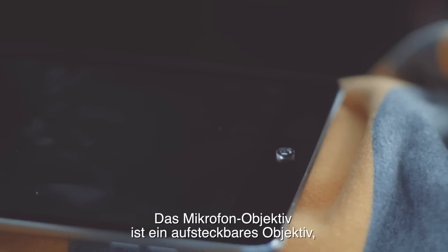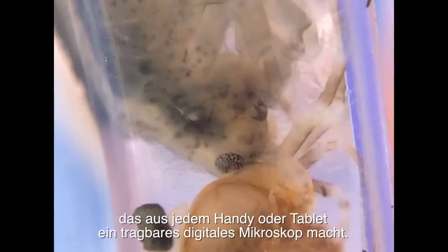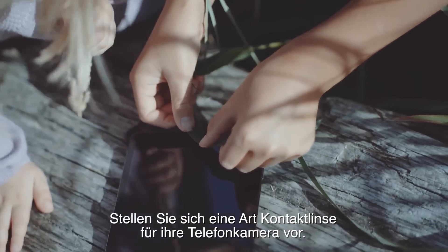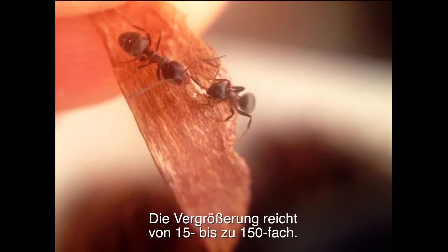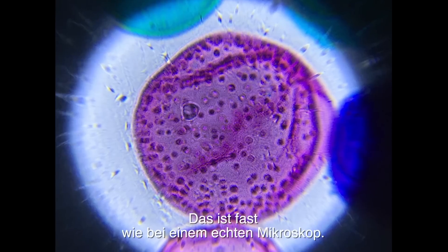The MicroPhone Lens is a stick-on lens that turns any cell phone or tablet into a portable digital microscope — imagine a contact lens for your phone camera. The magnification ranges from 15 times to 150 times, which is almost like a professional microscope.